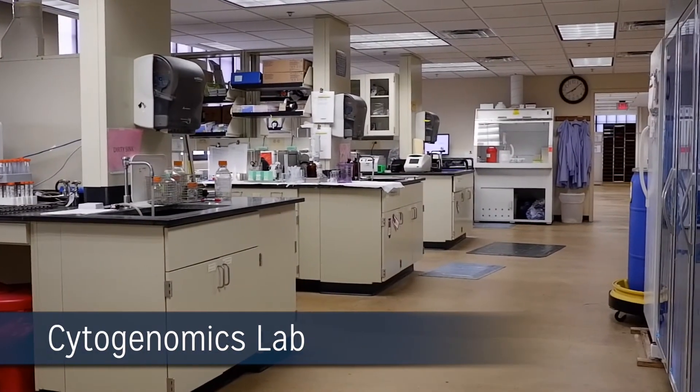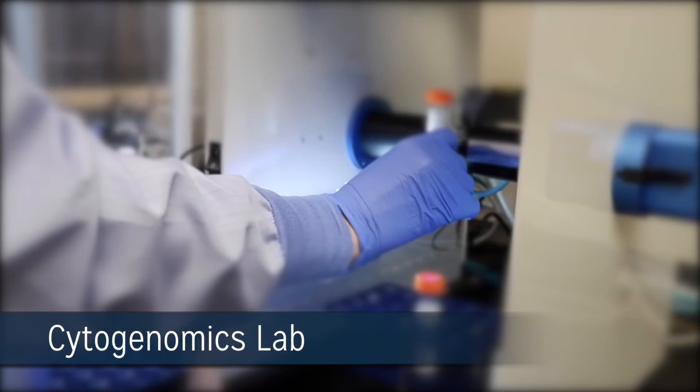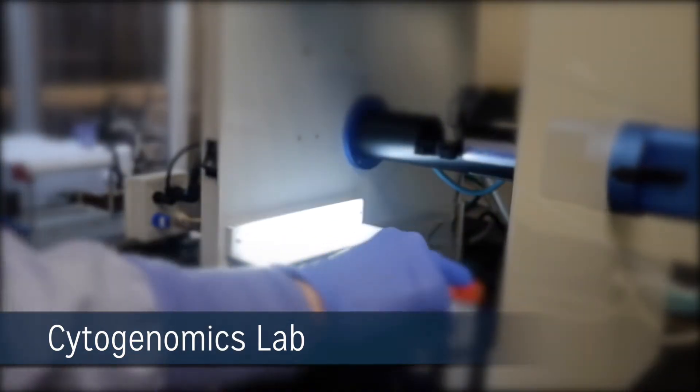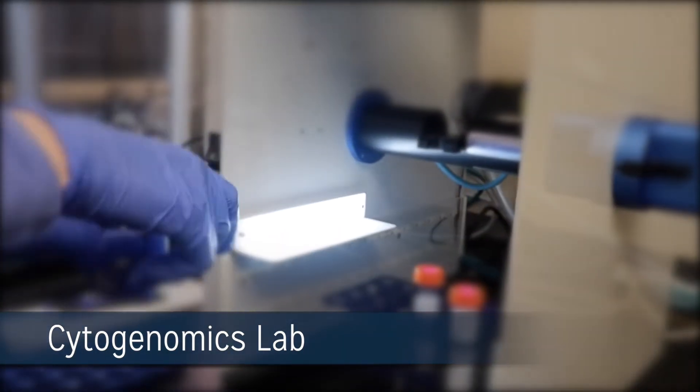The Henry Ford Cytogenomics Lab, as part of Pathology and Laboratory Medicine, uses lean techniques to drive improvements and innovation in its processes.